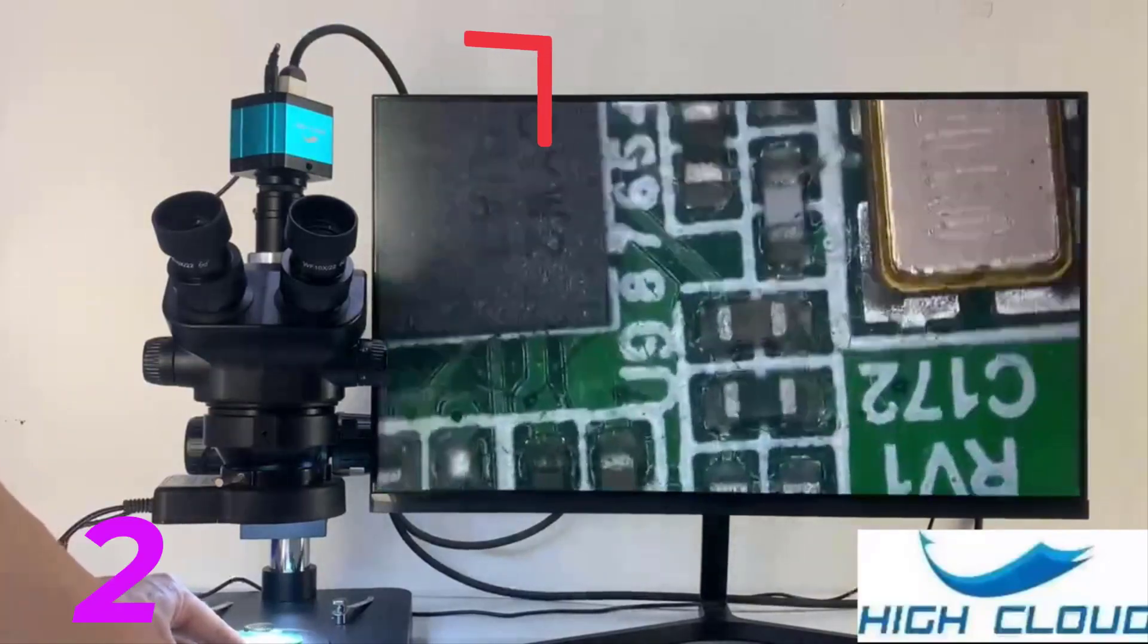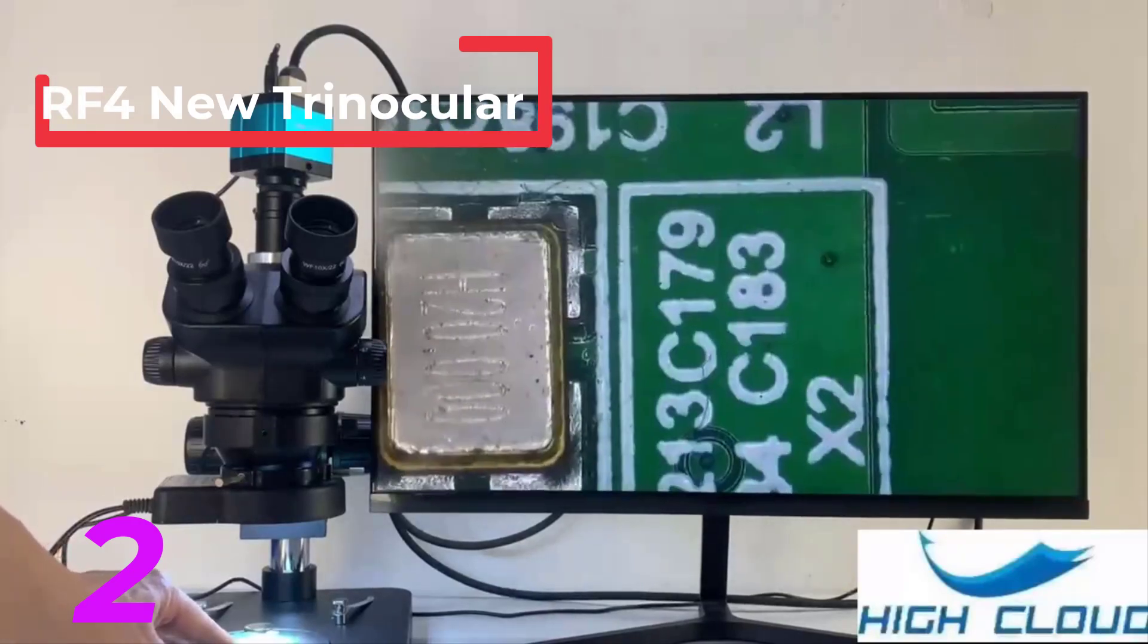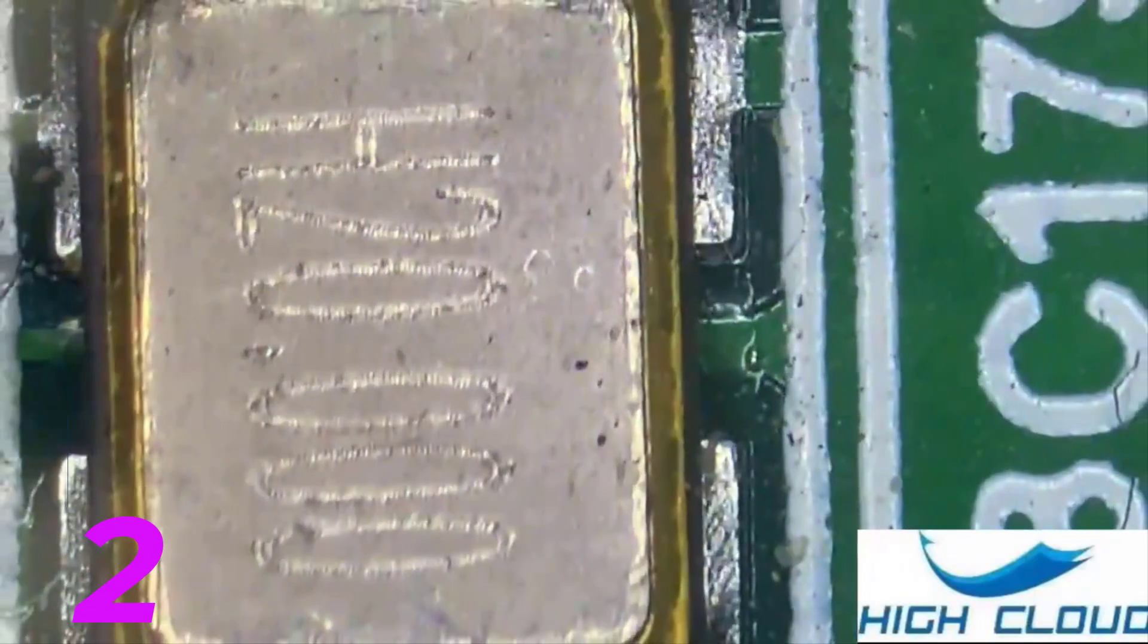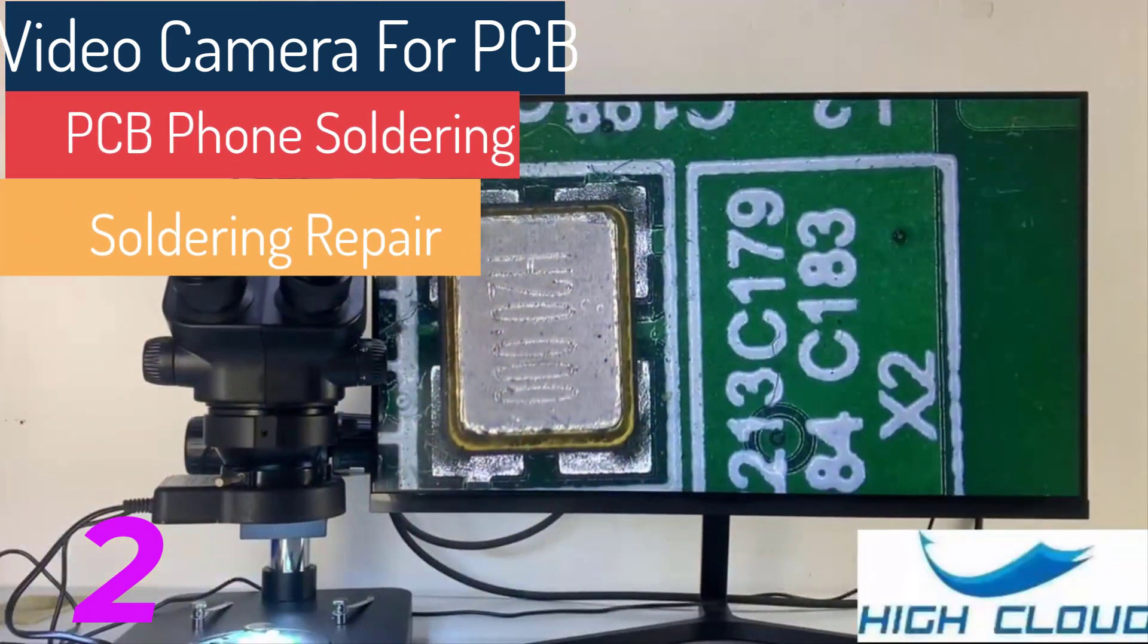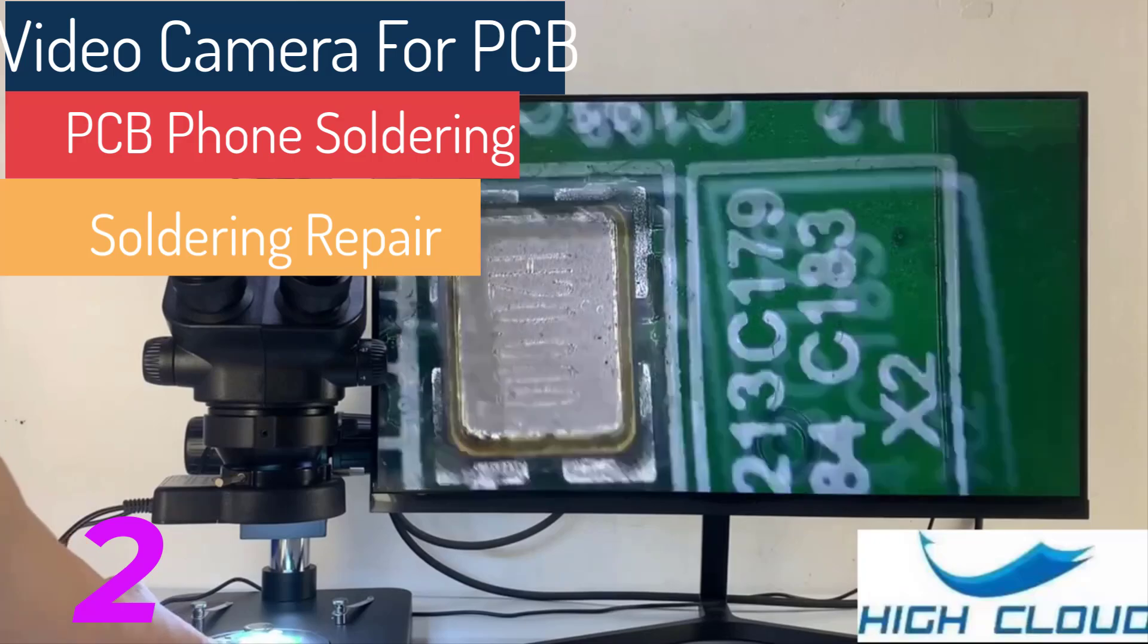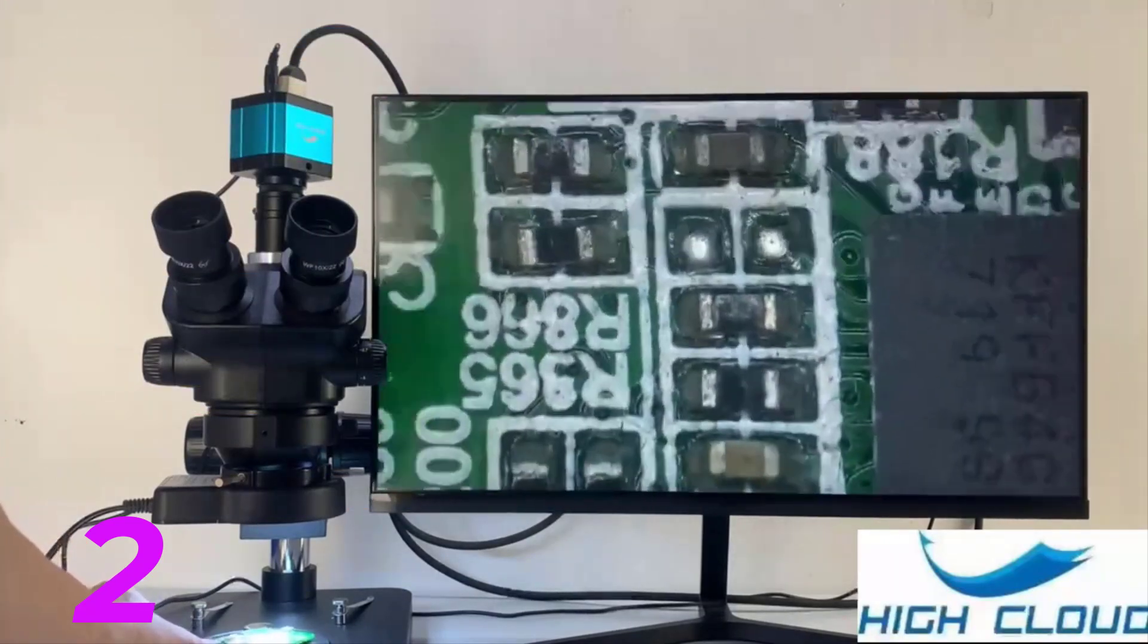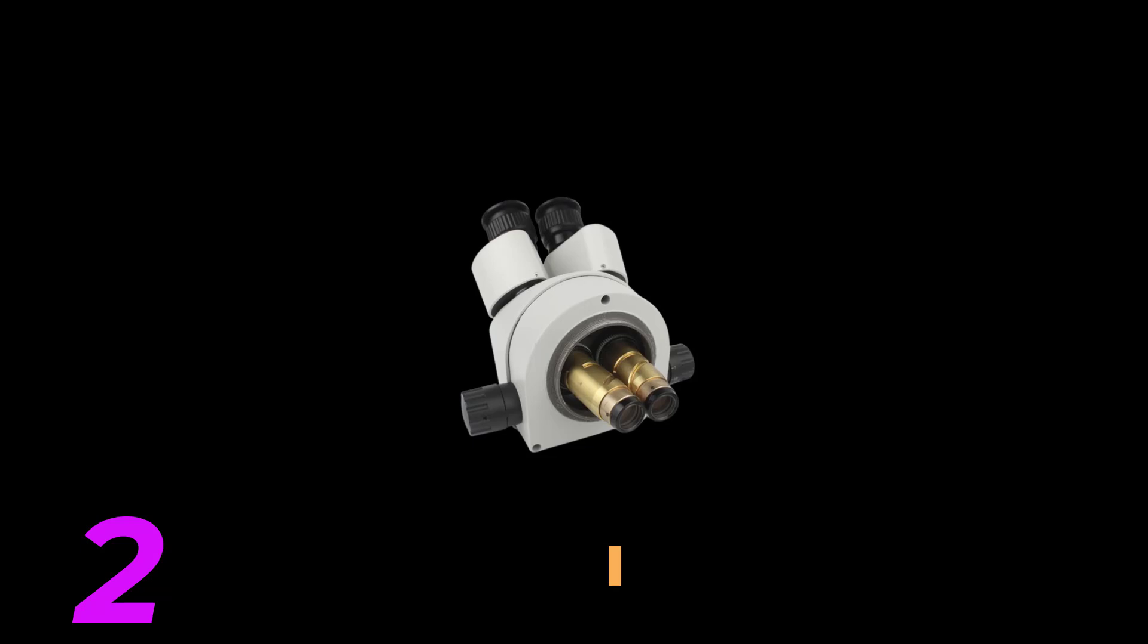This microscope is equipped with wide-field 10X-25X glass eyepieces fixed at a comfortable 30-degree tilt to reduce neck strain. These eyepieces can be easily adjusted for different interpupillary distances without losing focus. The 5-megapixel electronic eyepiece combined with the 360-degree 7-inch LCD screen allows you to get a larger and more detailed view, eliminating the need for an external display.